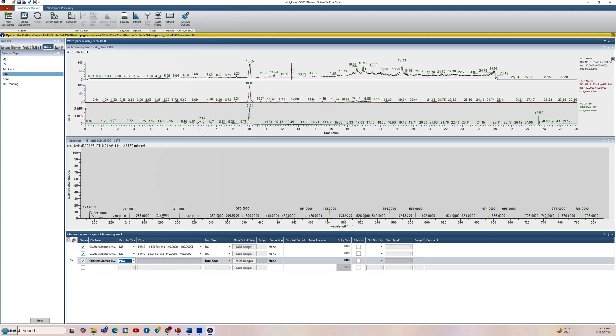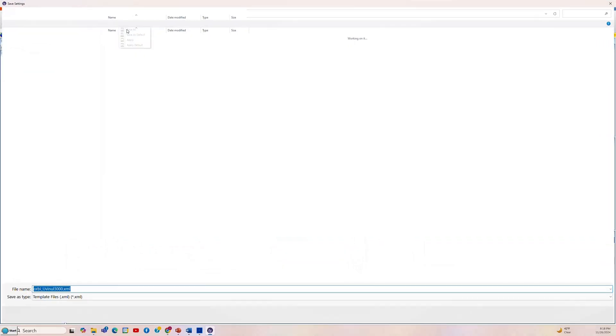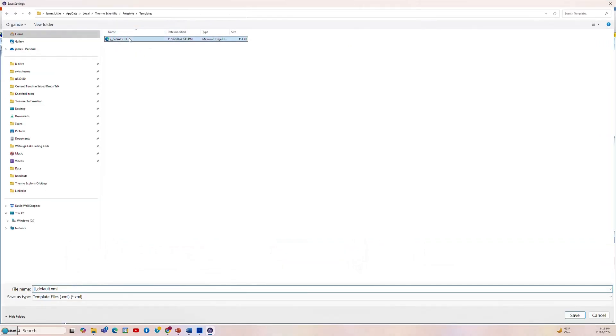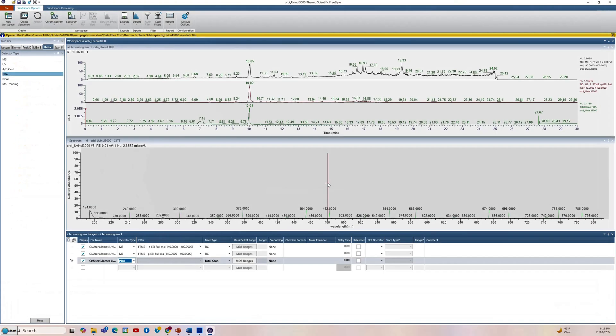So now if you look at the top, we have the positive on the top for the MS, the negative MS, and then the diode array. So what we need to do here is to save our layout. So we'll go to workspace options at the top. Go to layouts and say save as and we'll save it as JL default. I'll just overwrite one that I have there. We'll say yes. And now when we bring up a different data file, we'll have what we need and we won't have to go and do the setup the next time for every data file we open.